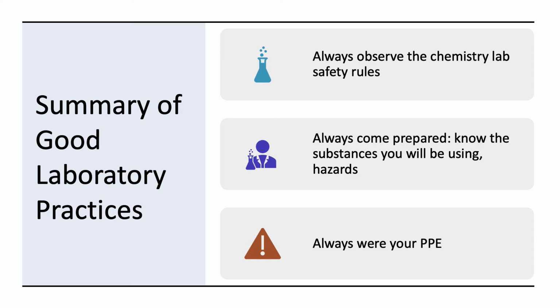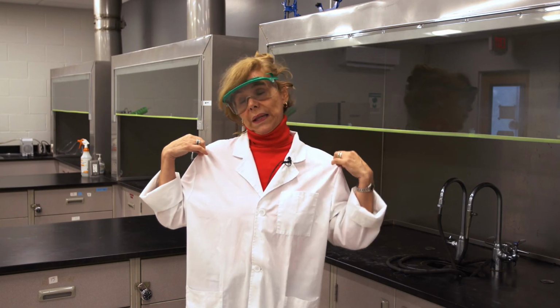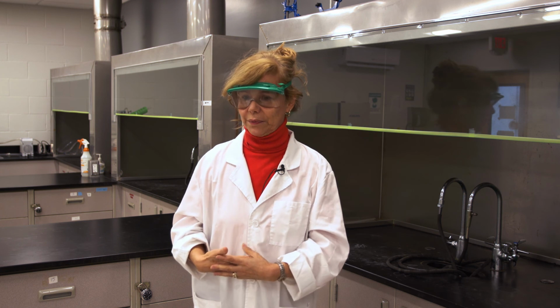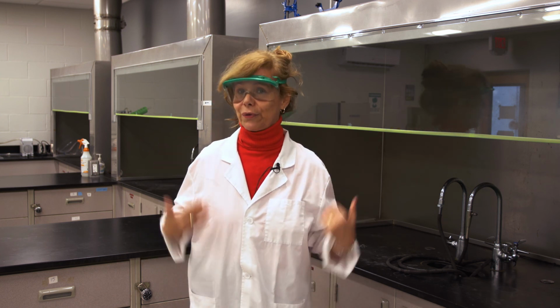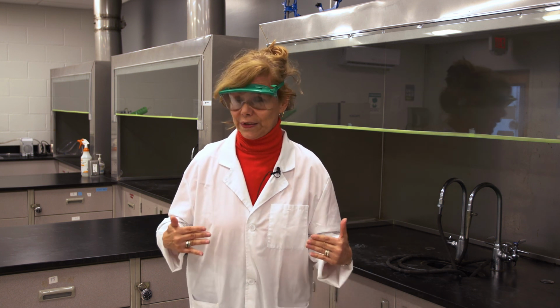Then, very important, wear your PPE, eye protection. The lab coat is recommended, it's not enforced, but I do recommend it. But you need to, again, have your PPE. We have heard it before from my colleague Alpheus: closed shoes, cover yourself. And meanwhile, I hope that you have fun while learning, but keeping safety. Our environment needs to be safe.